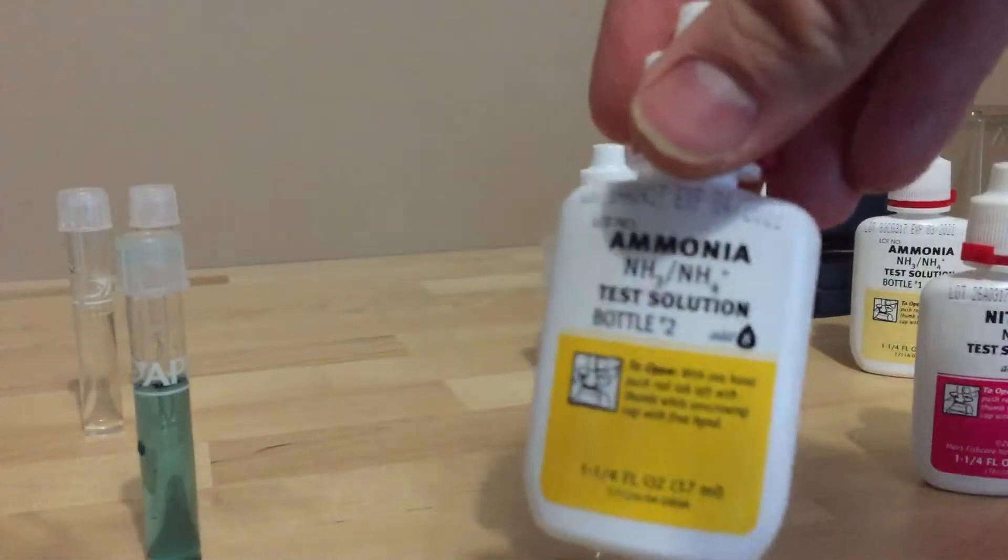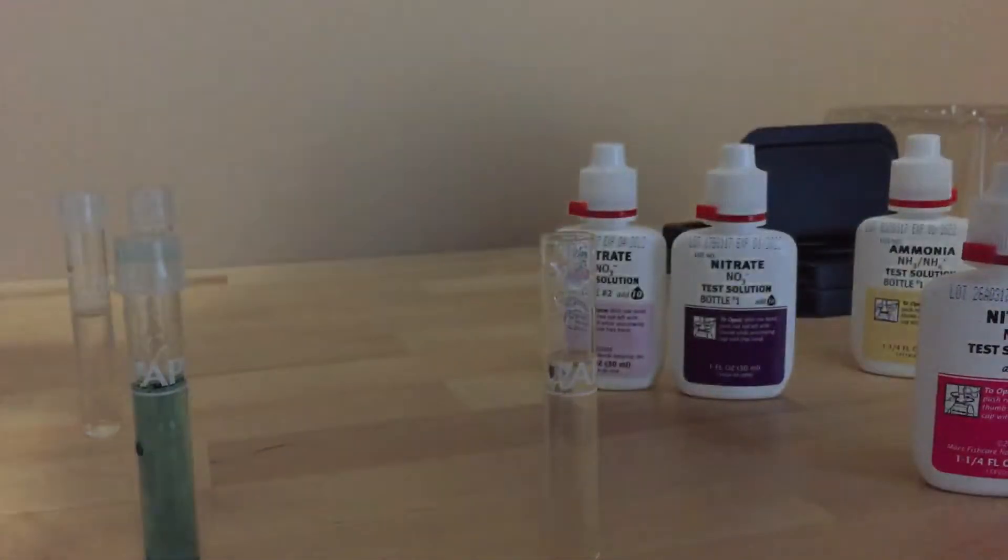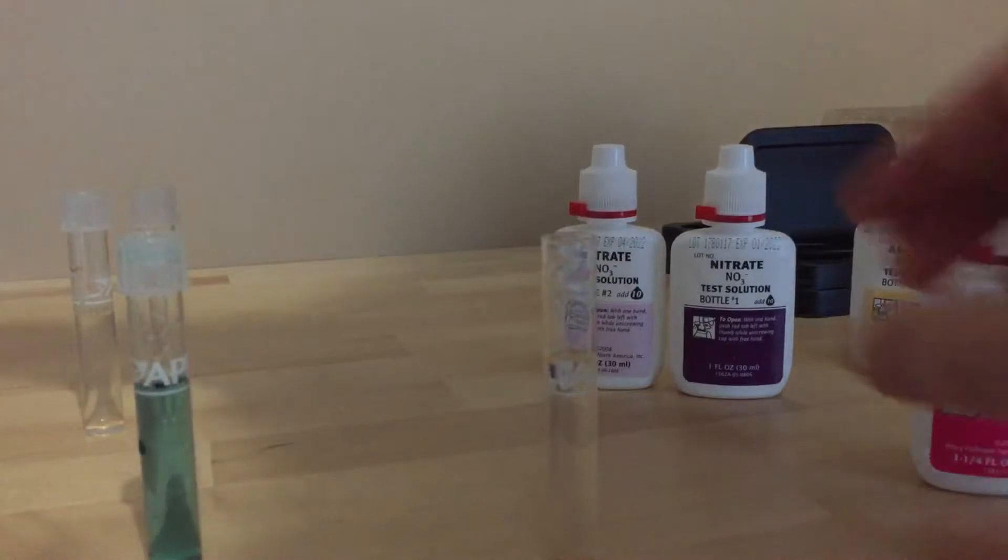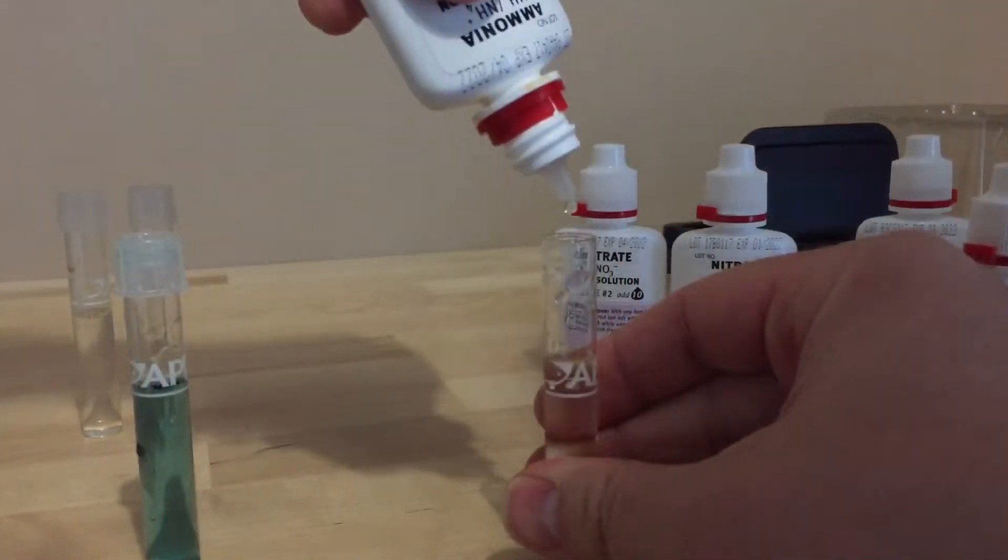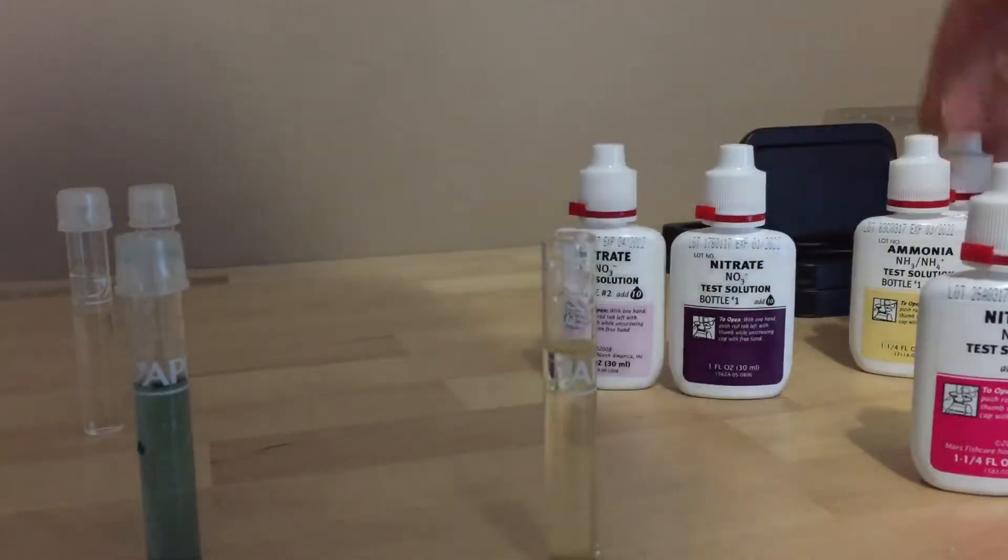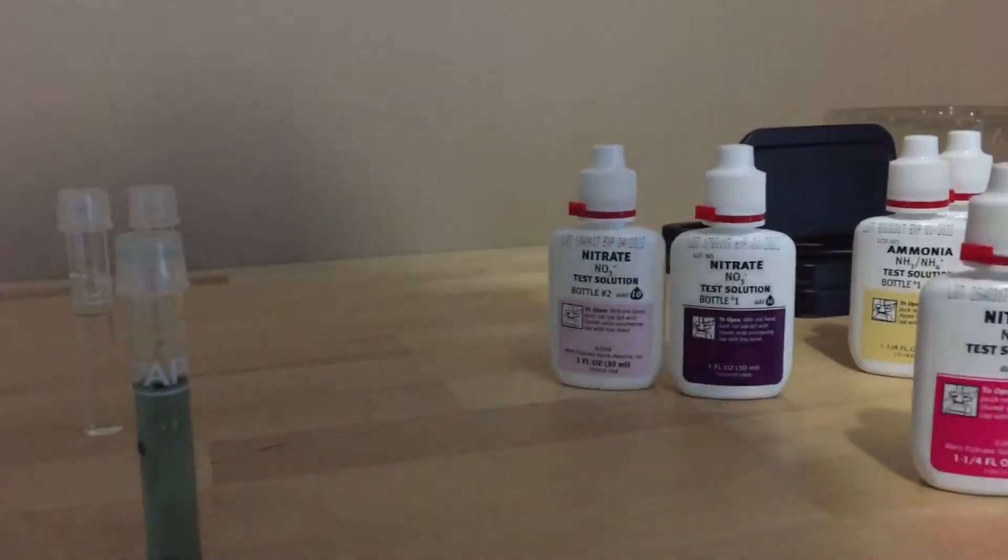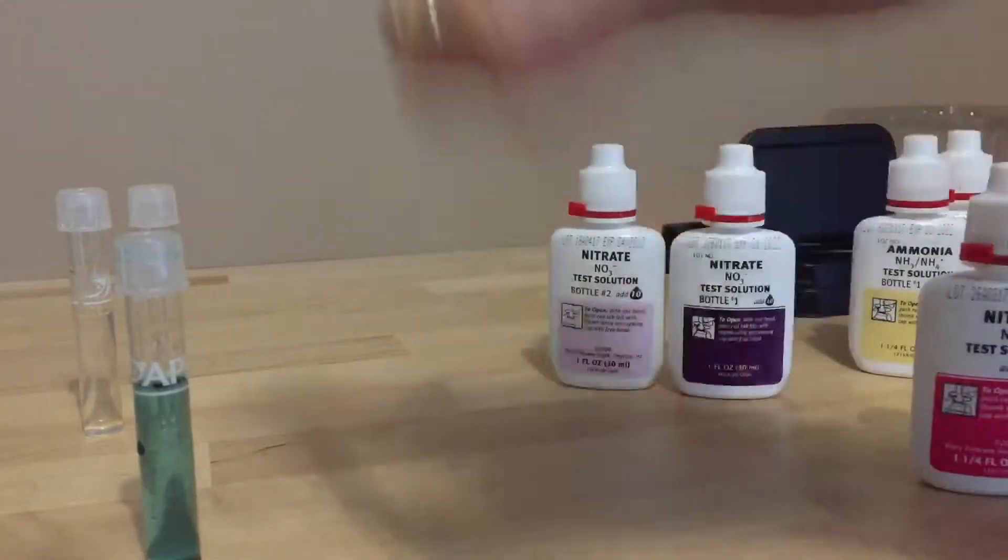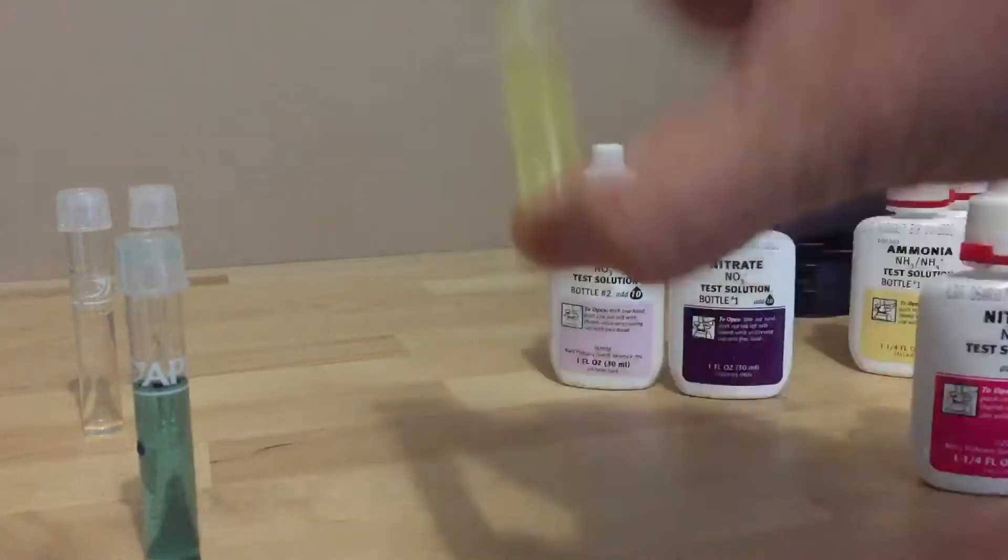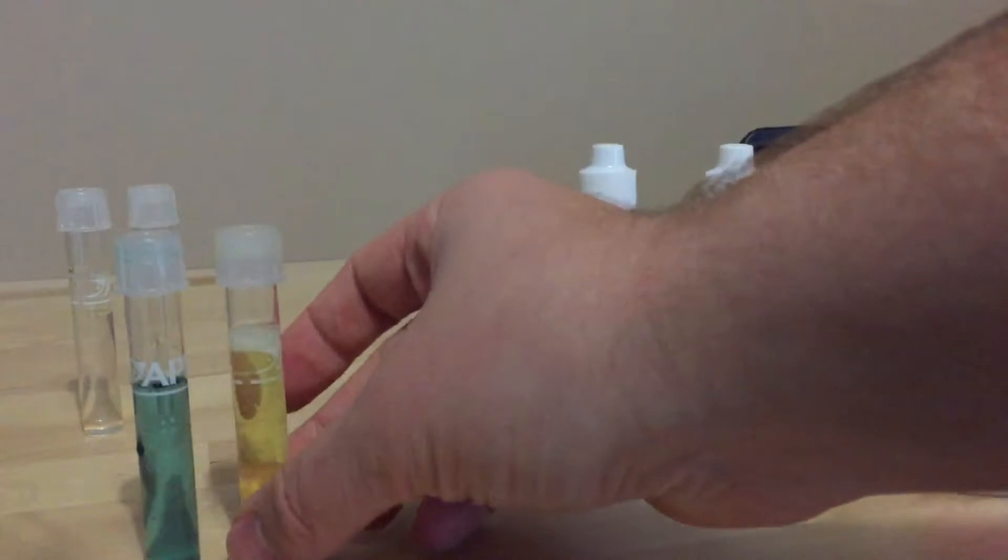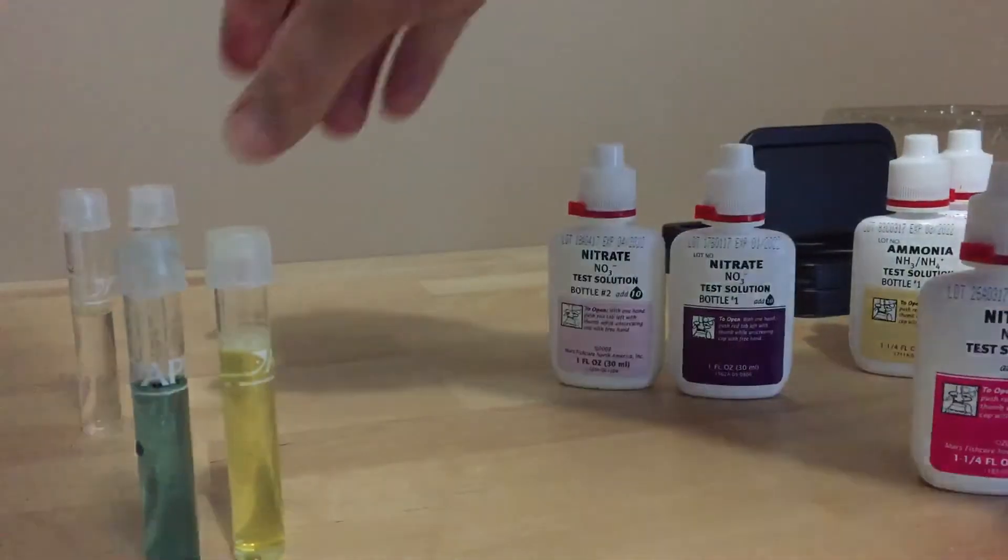So that's the first bottle. Then ammonia two, and again it's eight drops. Just give it a quick shake. One, two, three, four, five, six, seven, eight. Okay, that's the ammonia test. Again, put the cap on and just shake that, shake it for five or ten seconds, and we'll let that one sit so you can see the color development as it's sitting there.